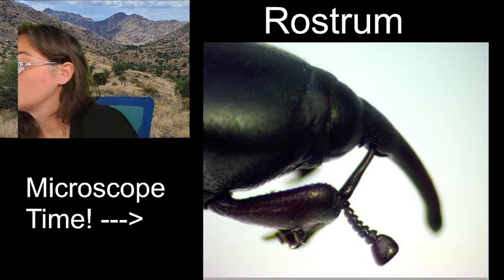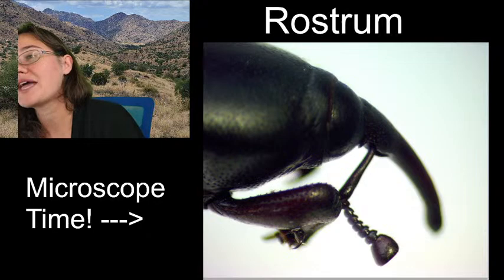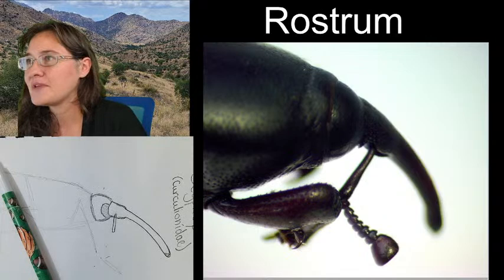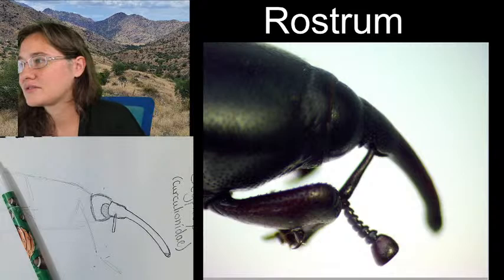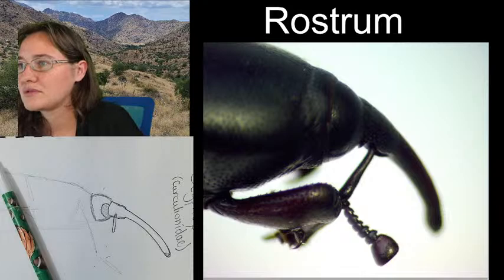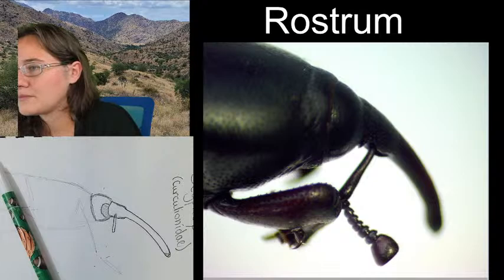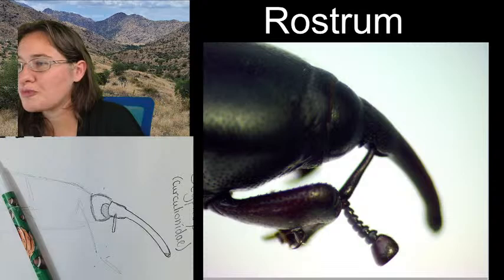What is the function of that club-like last segment? I'm not too sure. Let me go ahead and see if that information is out there. The antenna club is retracted and concave. I'm not sure what the actual purpose is of that cup-like segment on the antenna.